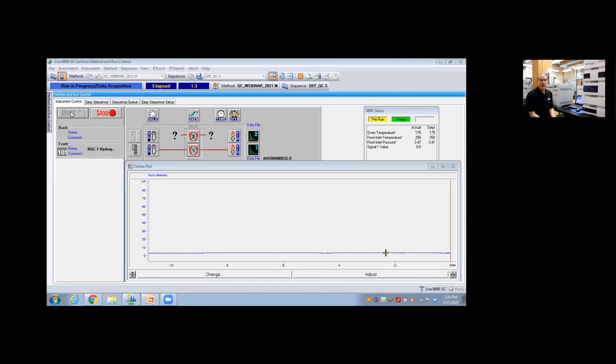Let's go ahead and change our name because we are now running hydrogen and we'll start our run. We gave it a little bit of time. Maybe two minutes to flush out. Probably maybe not quite enough. But we should be able to tell here in just a second how everything looks. Remember, when you're running a GC, the carrier gas, the mobile phase in GC plays no role in the separation. Its only job is to provide transport to push things through the column. We need the carrier gas to be inert. We could switch from helium to hydrogen and not affect that selectivity term, not affect the chemistry at all. Keeping the same linear velocity, which means we're going to keep the same retention time. So we could do this in such a way as to really not affect the chromatography at all, but make that switch from helium to hydrogen.